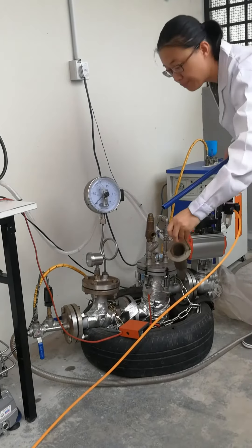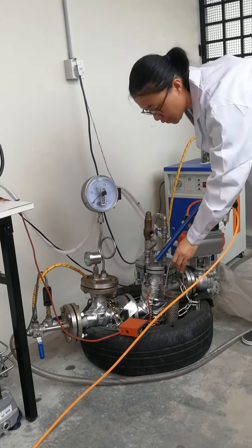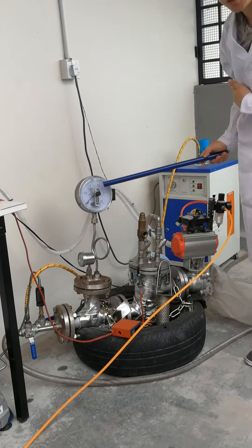The raw material is loaded inside the sample holder and loaded into the reactor. During the process, the temperature is controlled by the heating system outside and the pressure is controlled by the pressure meter.